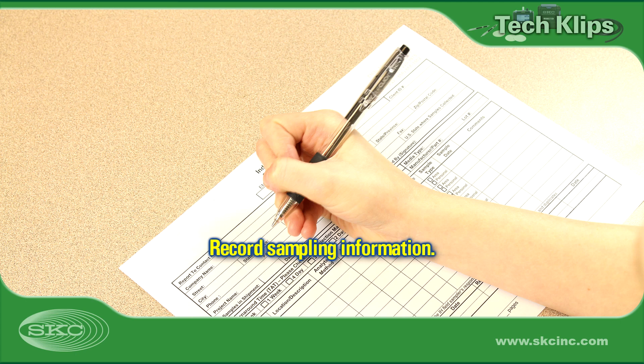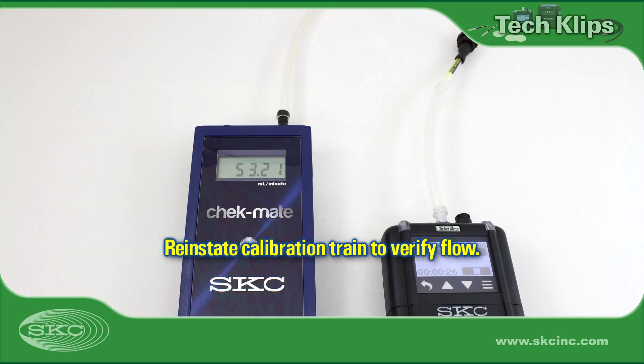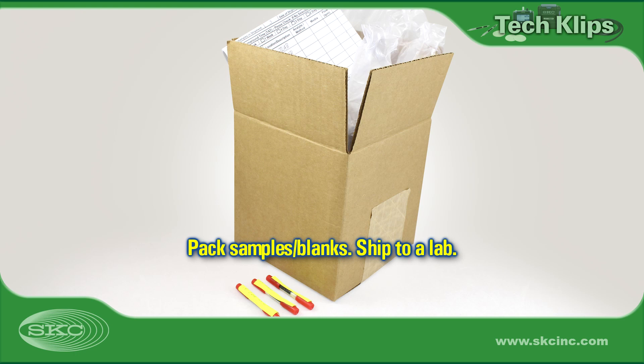Identify and label sample tubes and blank tubes for chain of custody. On a sampling sheet, record pertinent sampling information such as sample start and stop time, flow rate, temperature, and atmospheric pressure. Reinstate the calibration train to verify that flow calibration is still within 5% of the method-specified flow rate — this is to ensure that the sample is valid. Package all samples, blanks, and sampling information for shipment to an accredited analytical laboratory. Some samples may require shipment in a cooler with ice packs.